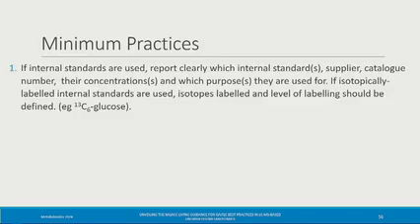And even just which standard you select has a really big consequence. So if you come to my talk tomorrow, I'll show you lots of results on how difficult it is. Yeah, because some endogenous species were sometimes considered to be exogenous, then we detected them in some samples and they became endogenous later. So it's just hard to define sometimes.